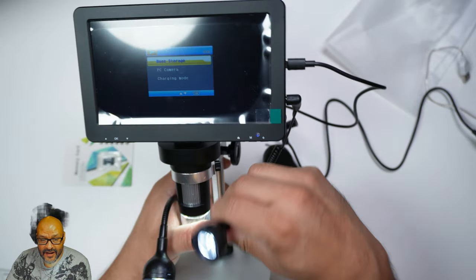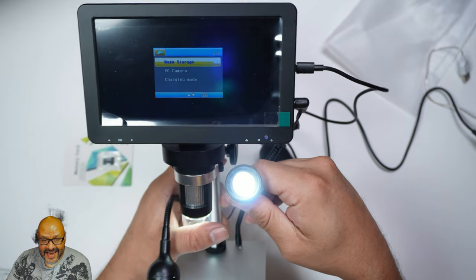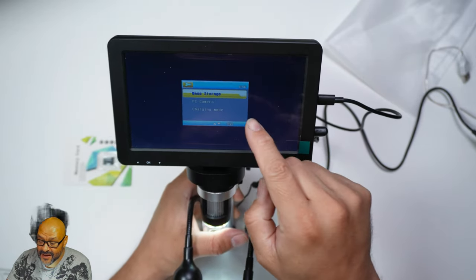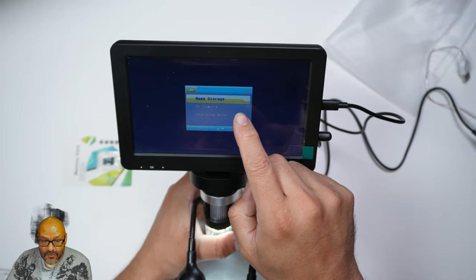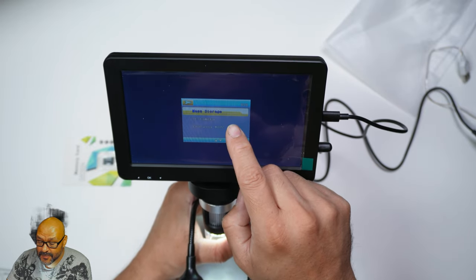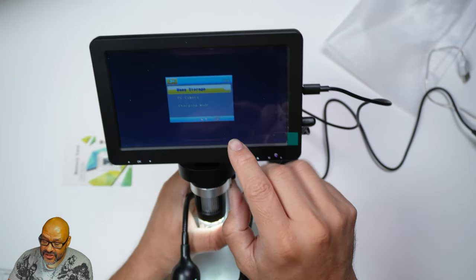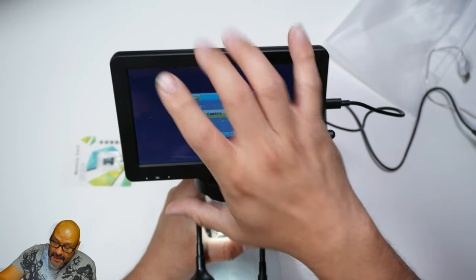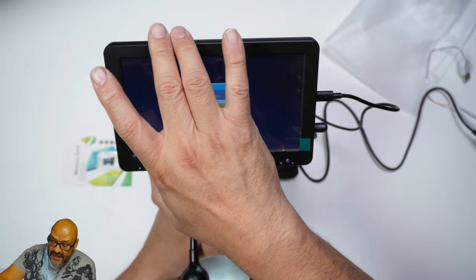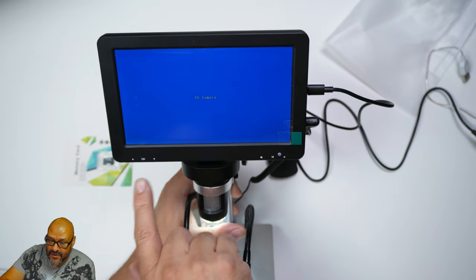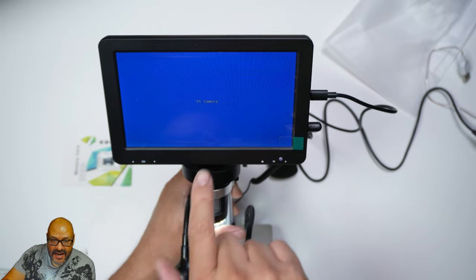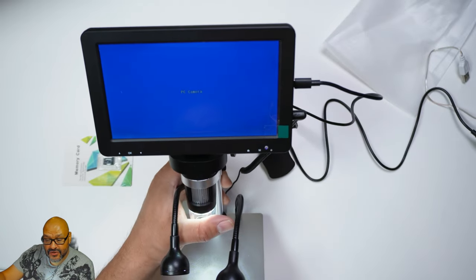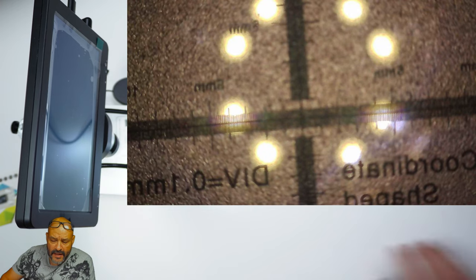Right when we turn it on, if you guys can see, the lights are coming in. It's giving you an option. What do you want to do? Memory card, PC, or charging mode? Right now we're going to say PC, hit okay. All the buttons are here. Now we're going to set up the camera to log into our computer.